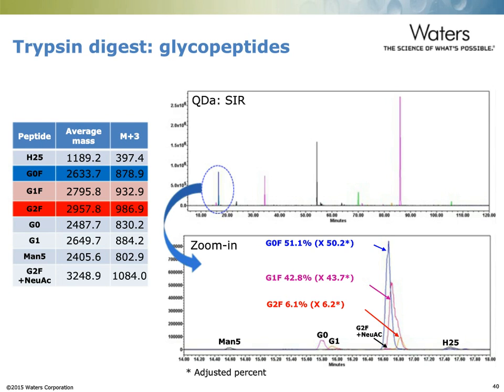So overall, looking at all of these results, this highlights the general utility of the QDA for doing routine monitoring of peptides, particularly as molecules move downstream, and the desire would be to move those on to more easy to implement mass spec platforms, of which the QDA would be an ideal candidate.